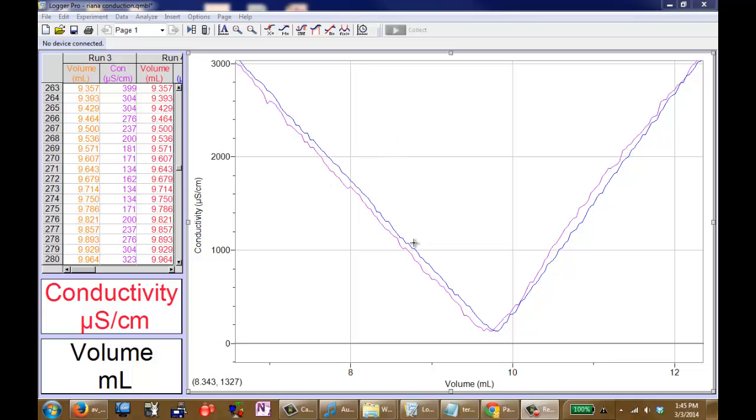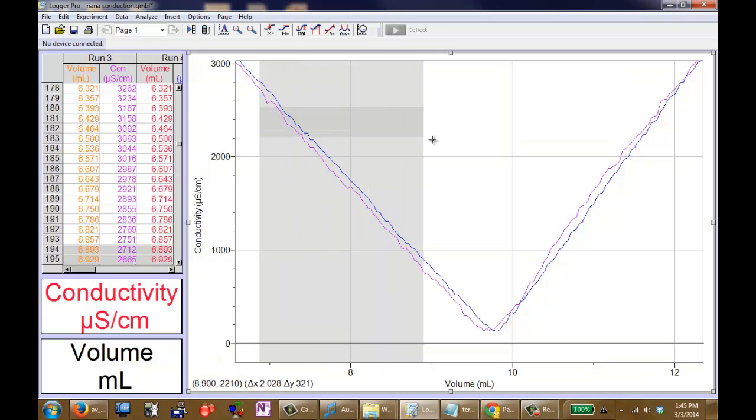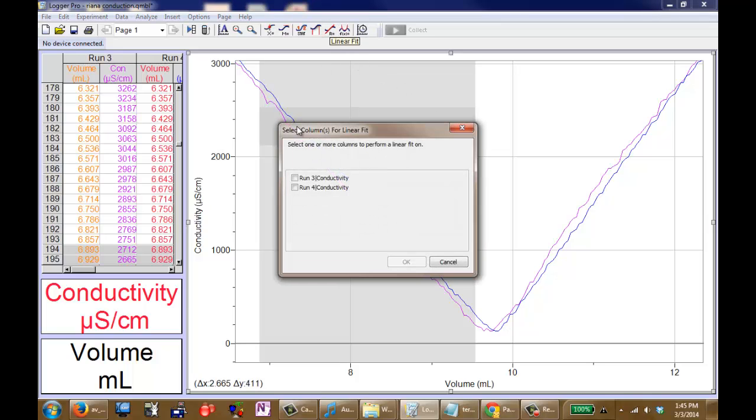These are the two runs that we did - certainly we did more than one although only one was shown in the video. Let me demonstrate how to analyze this data. First we'll highlight a linear section of the data and ask Logger Pro to give us a linear interpolation.